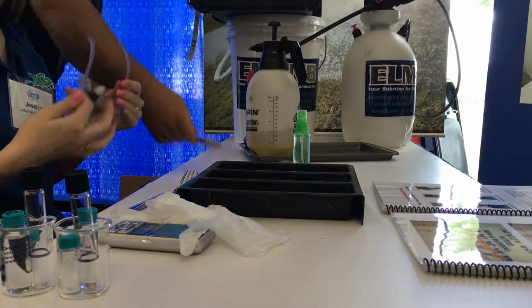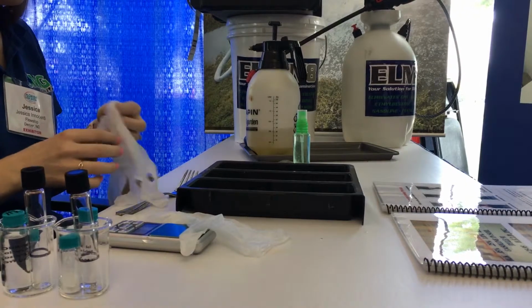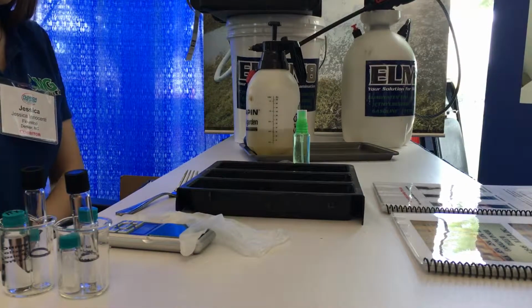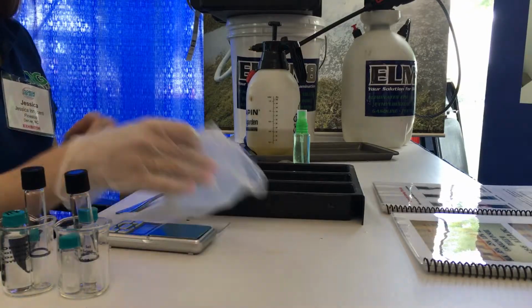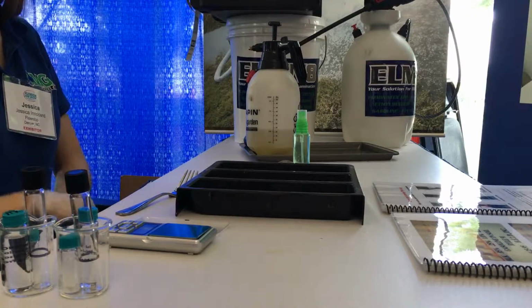Put our safety goggles on to protect our eyes. Everything's included in the kit. Put on our safety gloves. So glasses, gloves, and gravity, 3 Gs. Glasses to cover our eyes, gloves to keep our skin safe, and gravity means we're working with chemicals. Keep it out of your breathing zone.